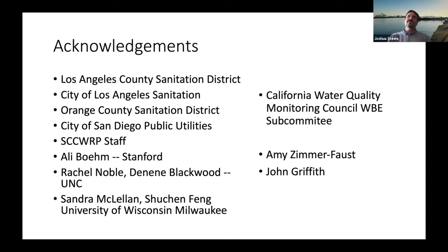So the first question of why wastewater and not drinking water: basically we're looking in this case at influent, so untreated wastewater. Treated wastewater, as well as treated drinking water for that matter, does a really good job of killing the virus. And so they were not particularly interested in that aspect of it as much. They were much more interested in what was coming in as a way of tracking the virus in the population rather than being worried about it.